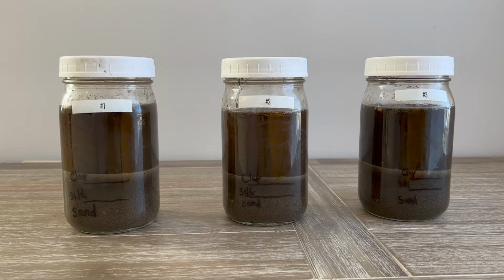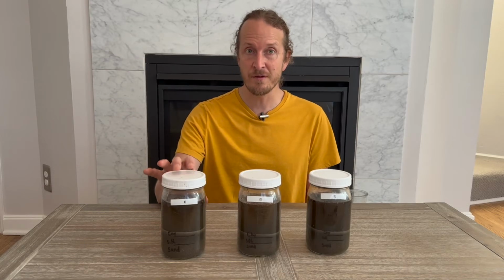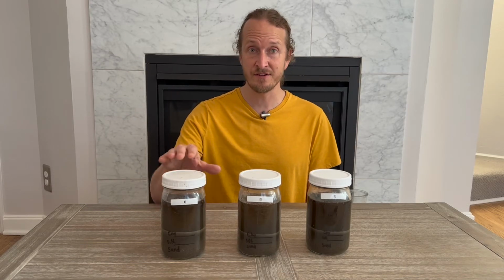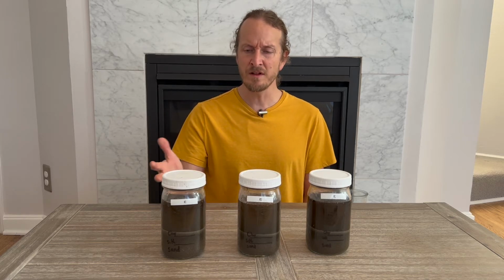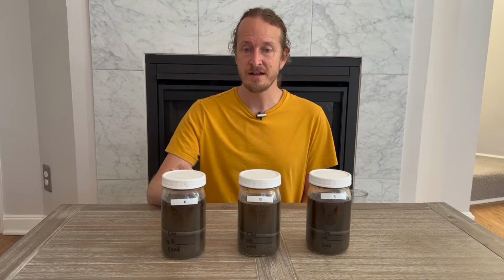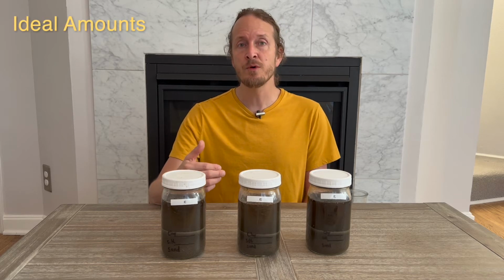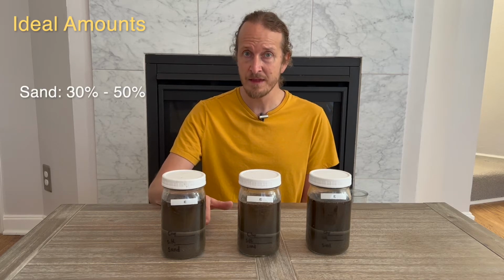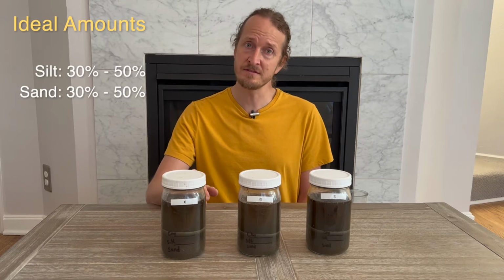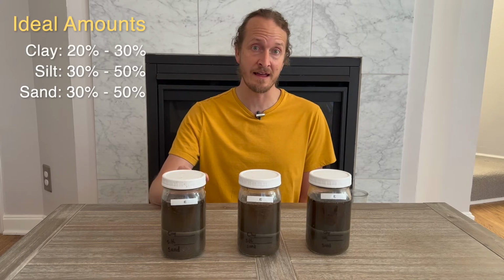So I've written down each of those measurements. Now let's work out the percentages. Okay, now that we have recorded the measurements of each of the different layers for each sample, let's talk about what's the ideal amount of each of these different layers. Ideally, we want about 30 to 50% sand, 30 to 50% silt, and then a little bit less clay, like maybe 20 to 30% clay.